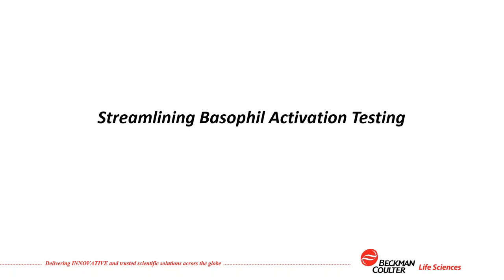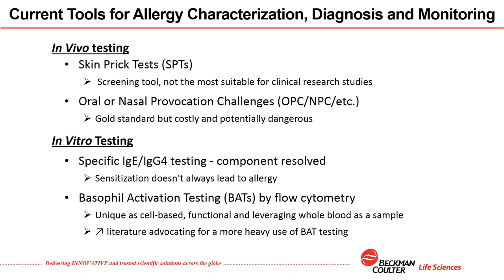We did use this similar concept to work on other questions. The first application I would like to speak about today is basophil activation testing. As a way to get started, I just wanted to introduce a little bit the field of allergy testing and what the current tools are for that.